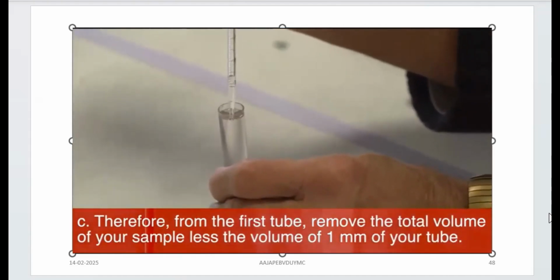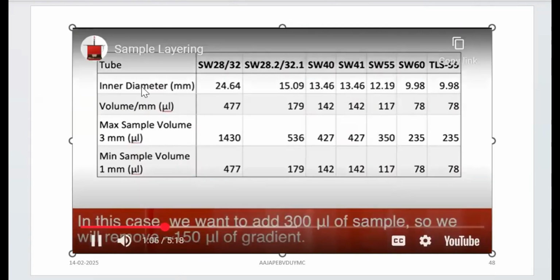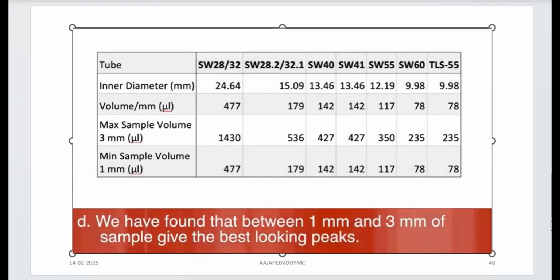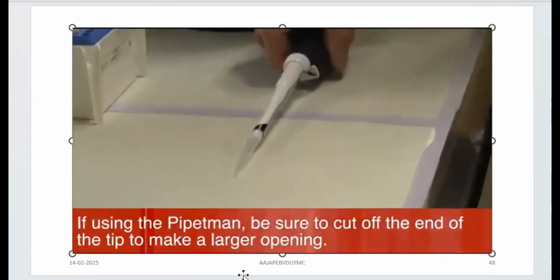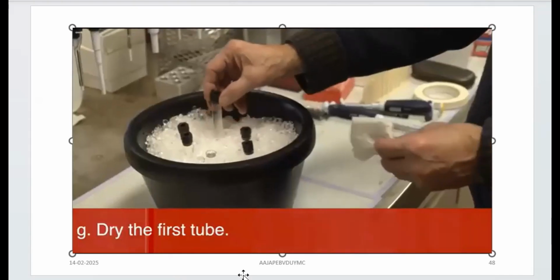These are the working details. Need not remember. It is just to know about. Yes, the tube inner diameter, the volume it holds, maximum sample volume, minimum sample volume. All these parameters you have to take into consideration. Now here they are using the tip.